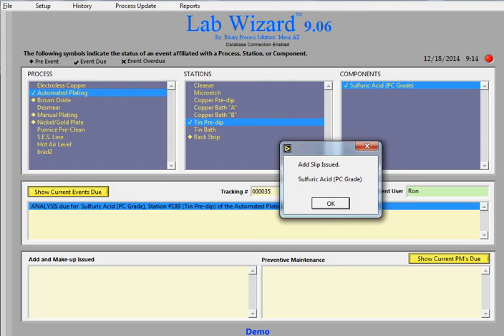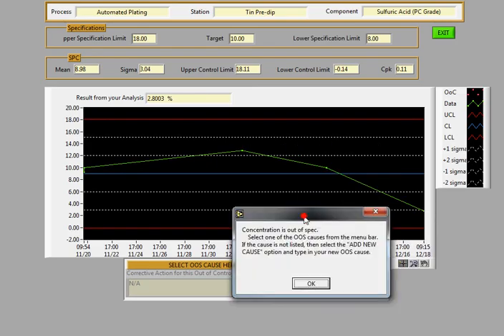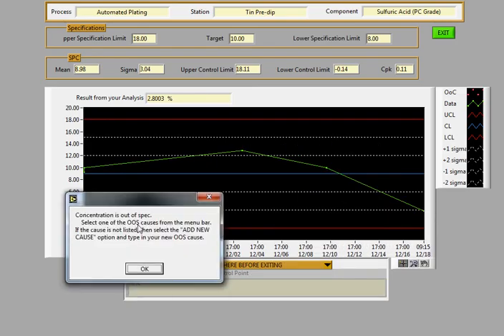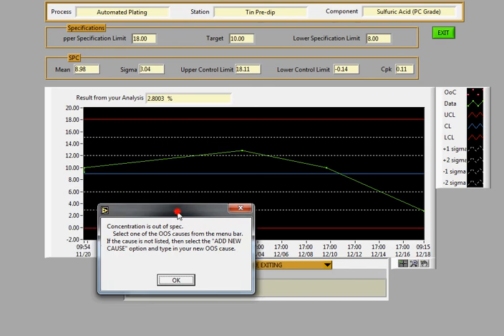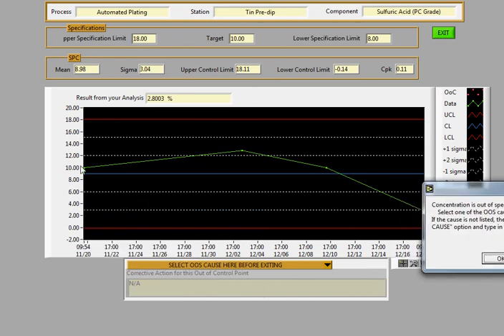So now the software is prompting that the add slip has been issued. You hit OK. And it's notifying that the concentration was out of spec. This is the check box that you had seen earlier during the setup of this component. It had prompted for, it had been enabled to allow this to pop up. And we can see that the trending is actually going down in this situation. And you hit OK.